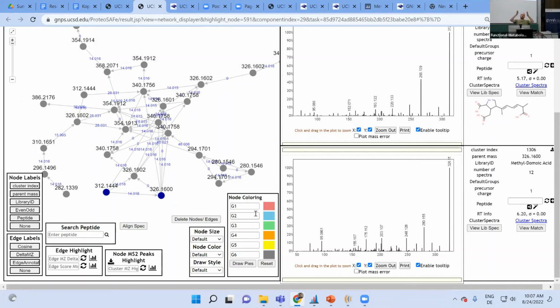Exactly. And then you have in your feature table the different columns for your samples. Then you will group them downstream, calculate a mean or average, and then you would build the ratio. Some of that we will do in the univariate analysis tomorrow with Philip. But that happens downstream. Right now, let's see this as a first exploration.